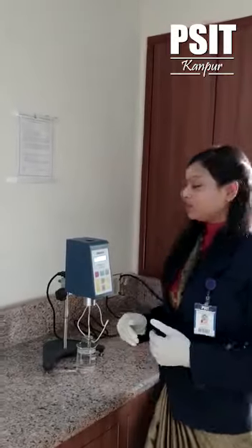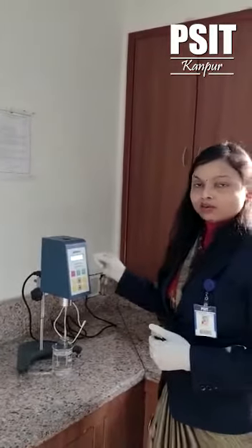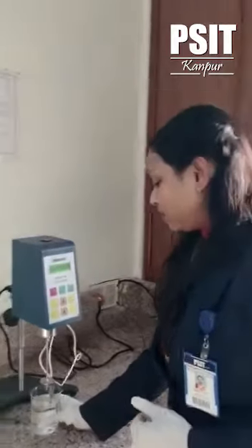This instrument is basically used to determine the rheological behaviors of fluid. We generally measure viscosity in centipoise by using this instrument. We have a polymer solution.